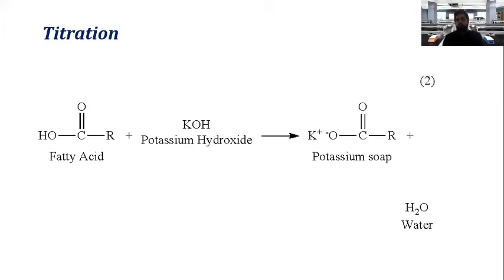What do you know about this titration by looking at this? What can you say? Very good. This is a kind of weak acid and strong base titration. For weak acid, strong base titrations, we can use phenolphthalein as the indicator. So that's why we used phenolphthalein.